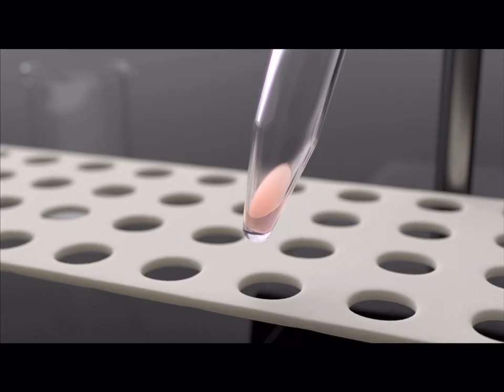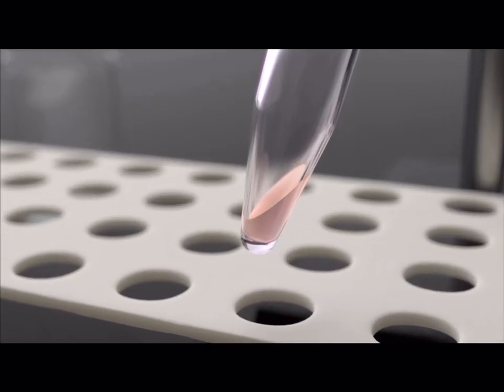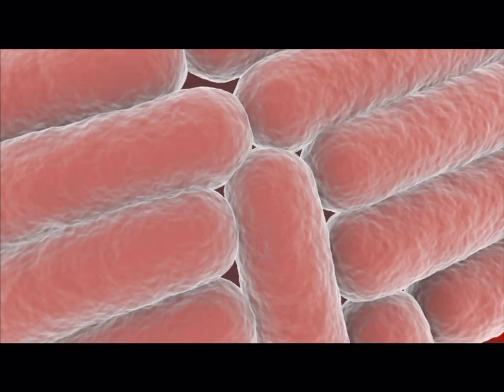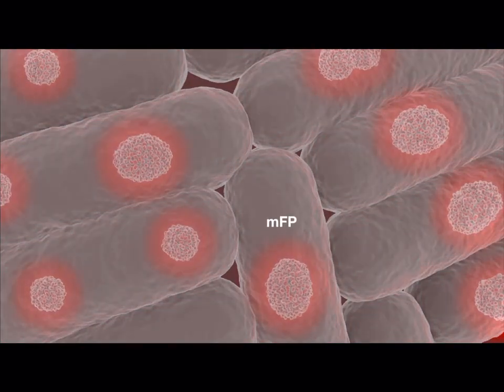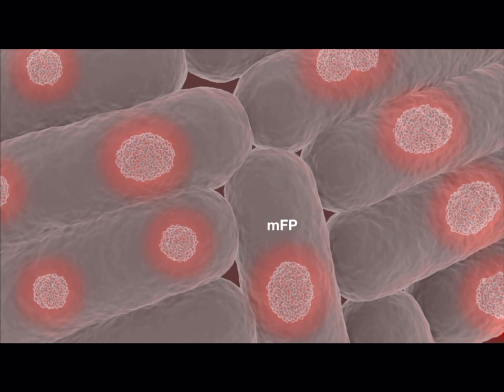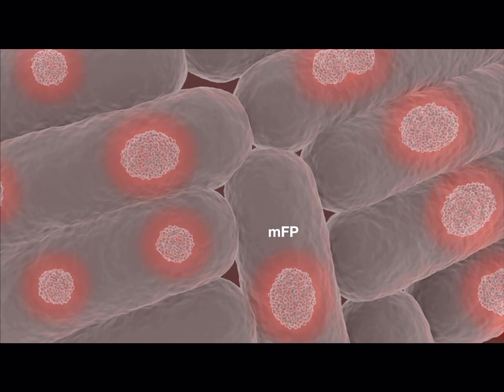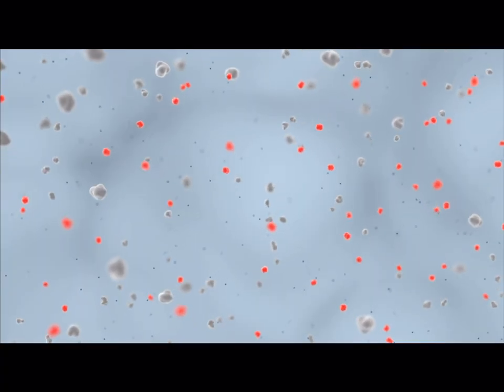The cells in suspension are then pelleted in a centrifuge and the supernatant poured off. The MFP-containing cells in this pellet are now ready to be broken down in a process called lysis. Lysis will release the clusters of MFP protein inside the bacteria into solution along with all the other contents of the cells.